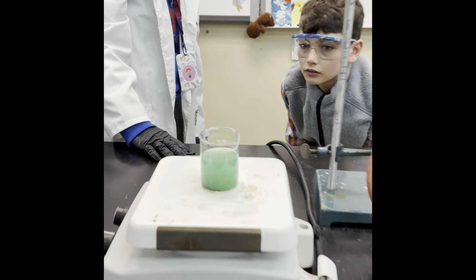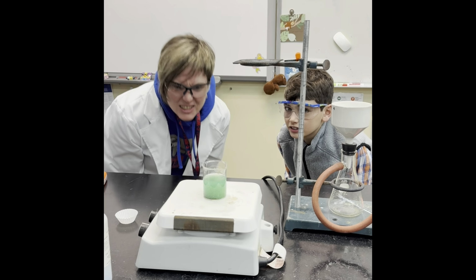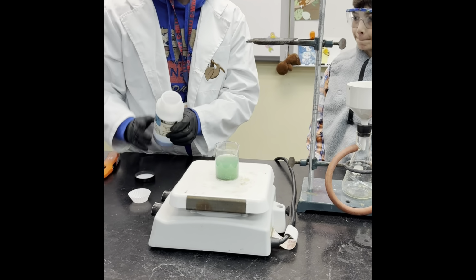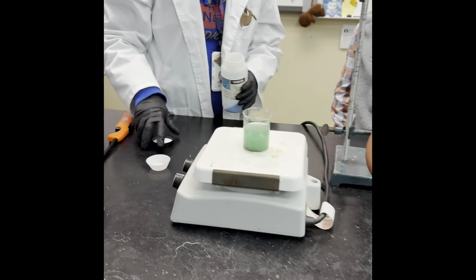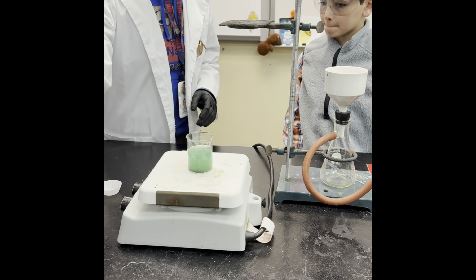But I would definitely agree. I agree that the solution definitely turned. You were saying blurry, kind of cloudy. Yeah, it's a little cloudy, and it's definitely way more green rather than this was kind of the color we started with of the copper sulfate. Yeah, it definitely is.